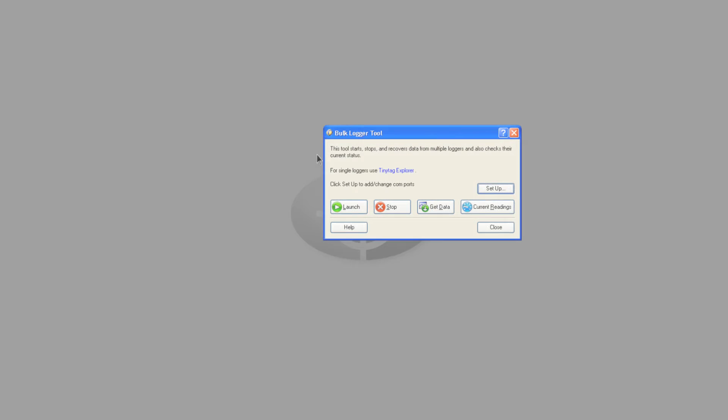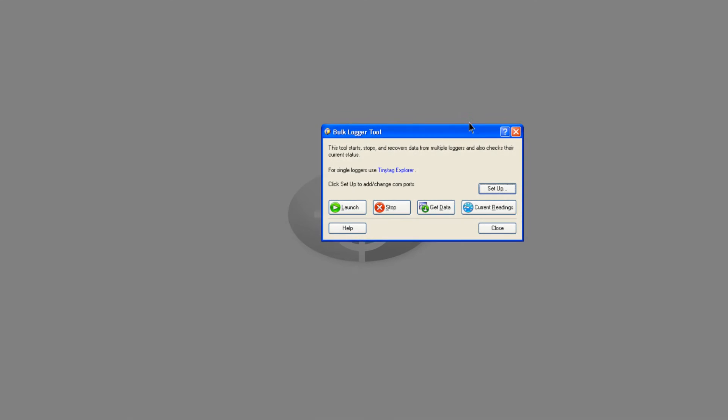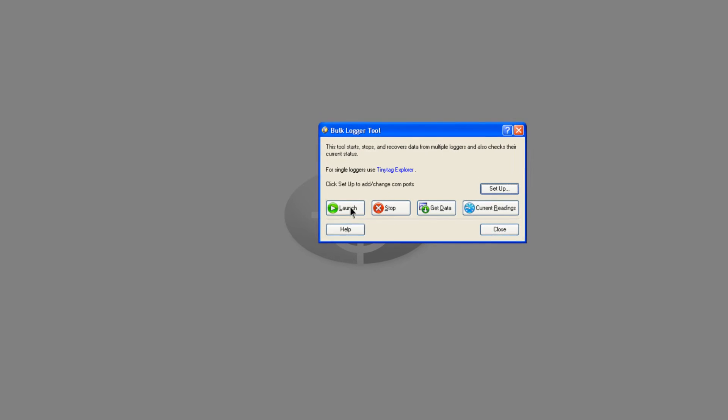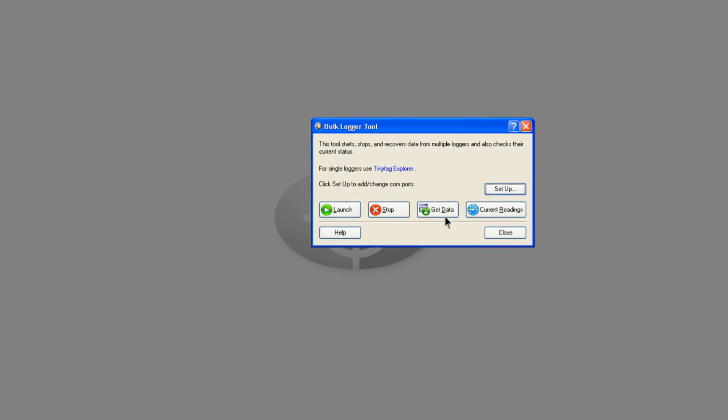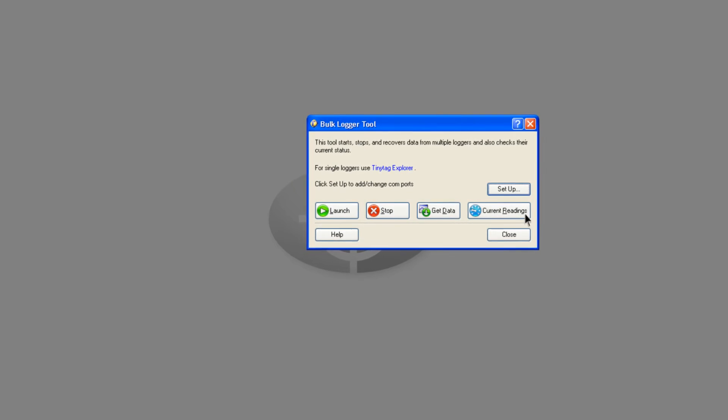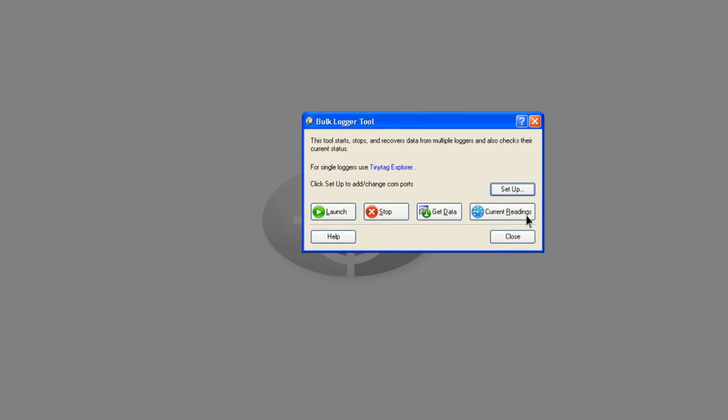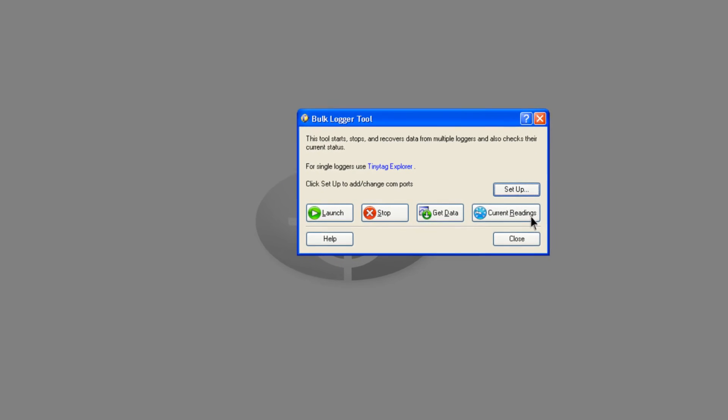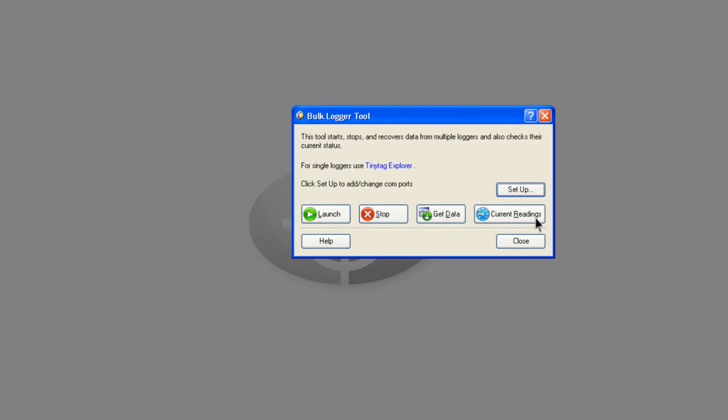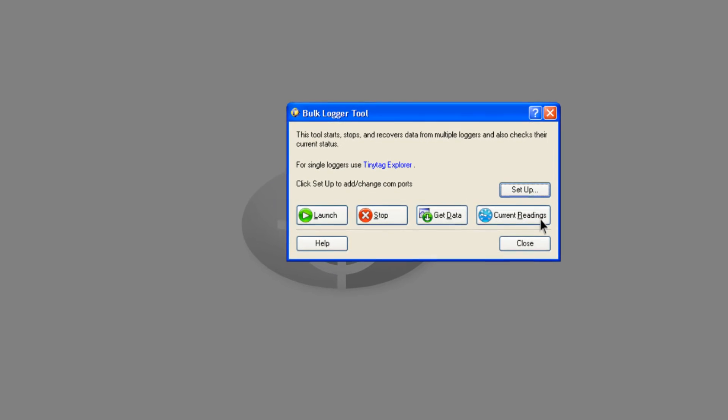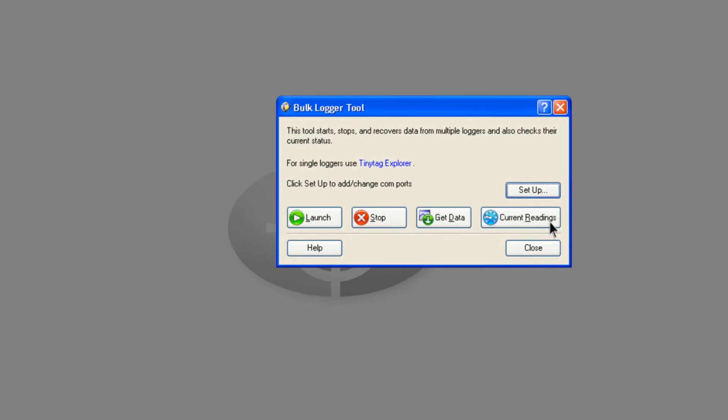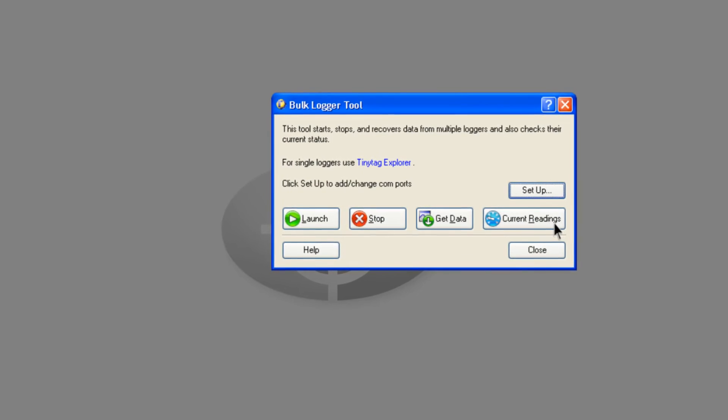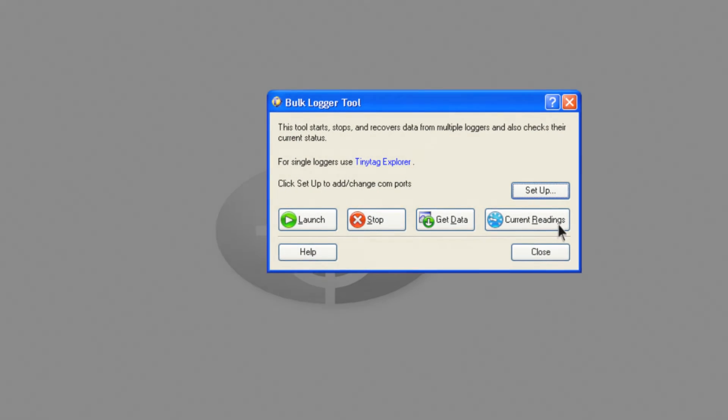Other features of TinyTag Explorer include the bulk logger tool to start, stop, get data from, and view the current readings of multiple data loggers at the same time. This can significantly reduce the time needed to manage multiple loggers.